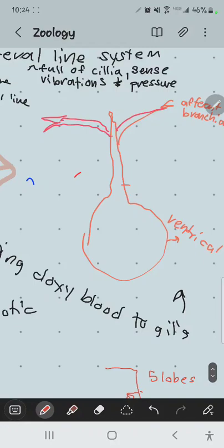It's just that here they're segmented out. You can see they're ganglia. Here we have basically 5 ganglion lobes of the brain, but because they're all combined together, that's why we call it brain and not a ganglia. Got it? So this is optional. I don't have that one checked, but if you want to check it out, it's kind of cool.